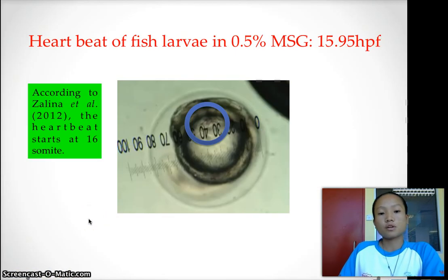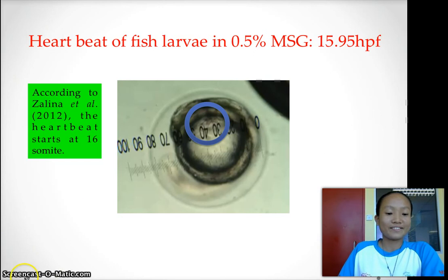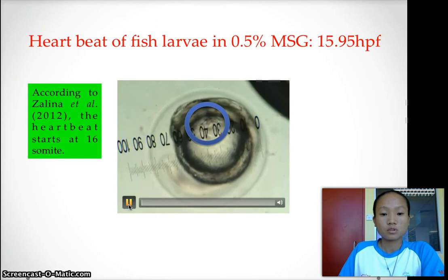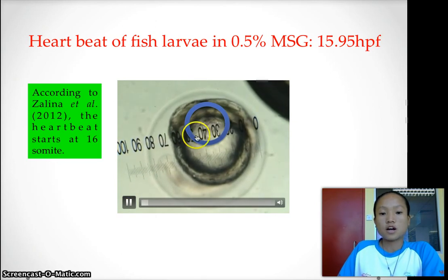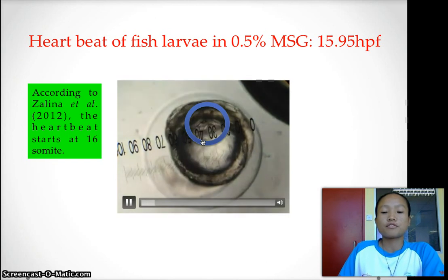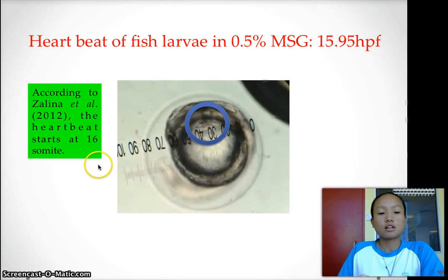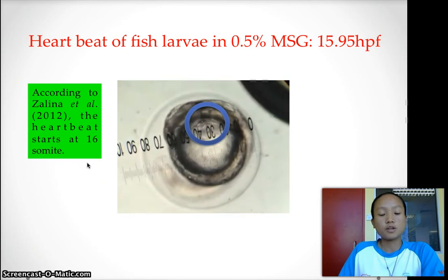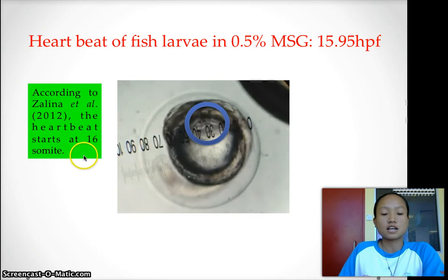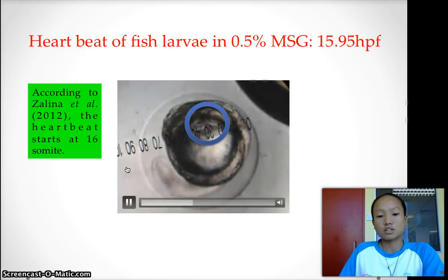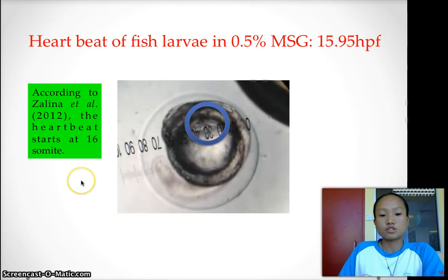Here we will show you the heartbeat of the fish larvae embedded in 0.5% MSG. According to research done by Zalina et al. in 2012, the heartbeat of a normal Anabas starts at 16 somites. However in our case, we could not clearly see the somites due to the orientation of the fish larvae.